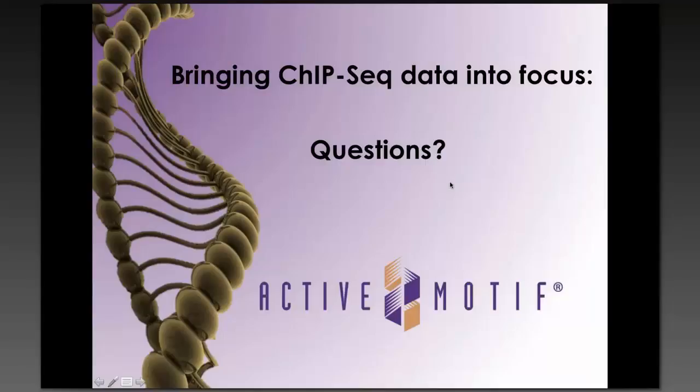This person is a new entrant to ChIP-Seq, and they're asking, when you compare treated versus untreated samples, do you average sequencing information from the controls under each condition? Yeah, so the control in this case would be sequencing of an input sample, which is unprecipitated genomic DNA, and we do pool the input from both samples into a single control reaction, and they're both normalized to that same control.